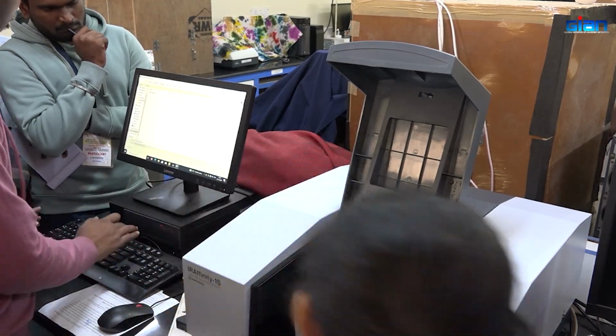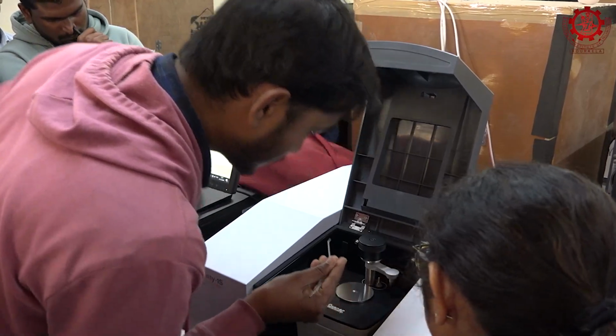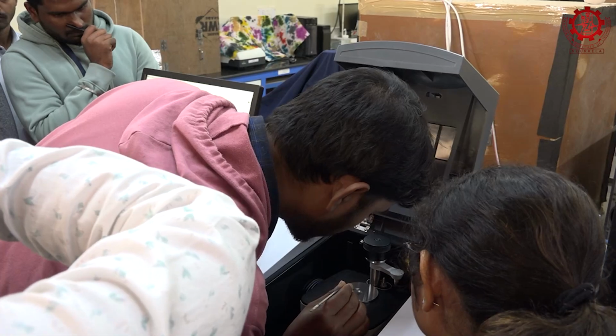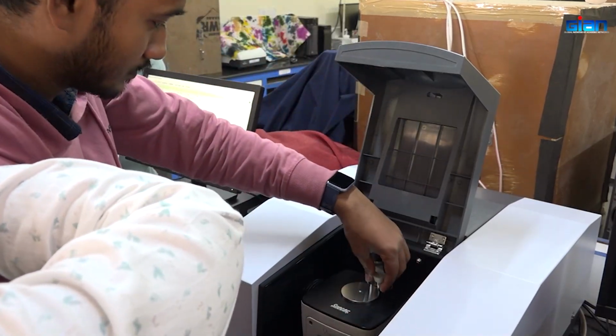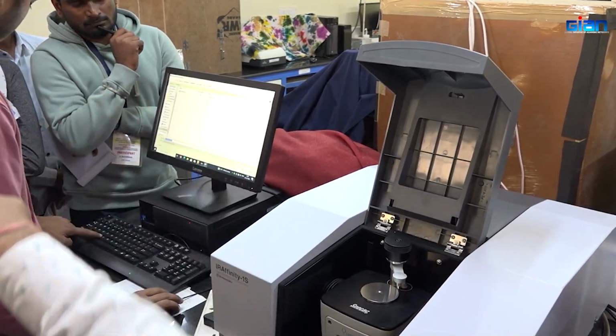So, we can clean it afterwards. There is a very small point. Try to put your solid on top of it, because if you put it everywhere except that, you will not have a good spectrum.